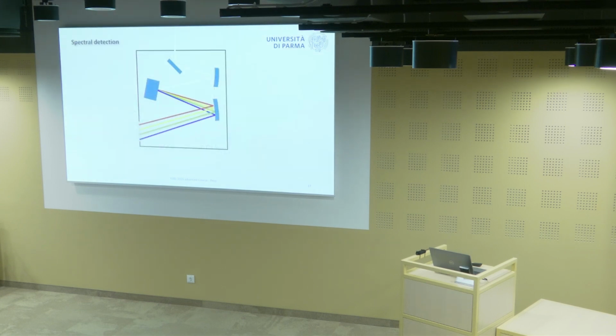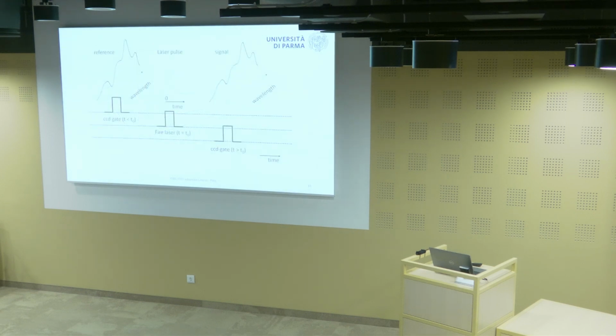Now that's single wavelength detection. If you use the system with the spectrograph and the CCD, you take a snapshot at fixed times. And the snapshots can be taken like with a gated CCD that allows you to take pictures with exposure times as short as 2 nanoseconds. So you can make very precise and time-resolved acquisitions. The principle is the following. This is the time the laser comes. You collect your reference profile before the laser hits, and then you set the delay at the value which is after the laser pulse, and you collect the time, the wavelength dependence of the intensity.